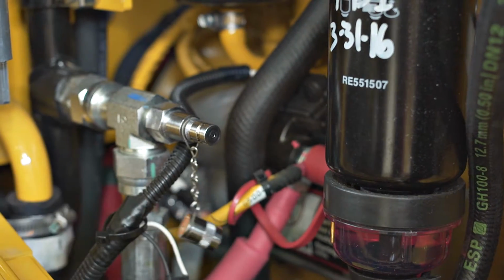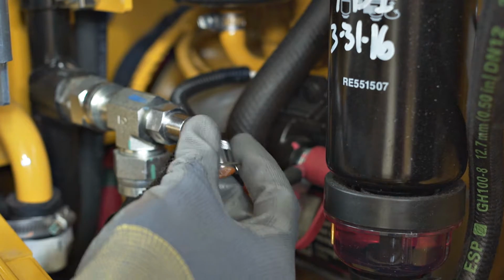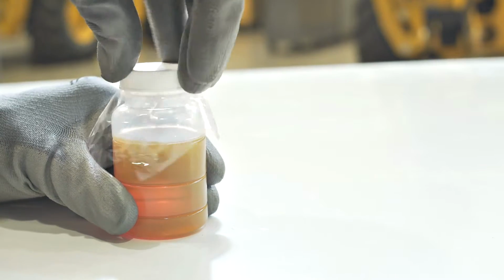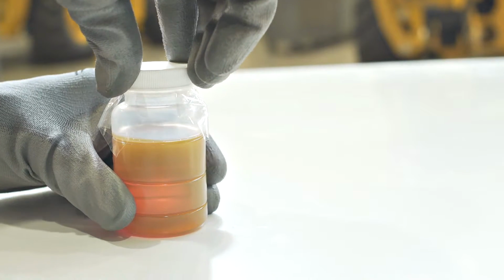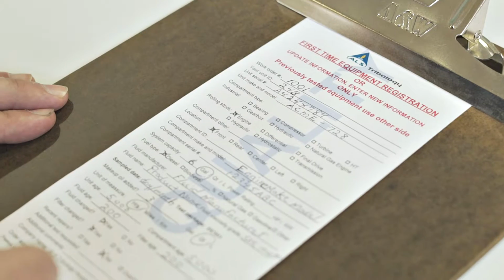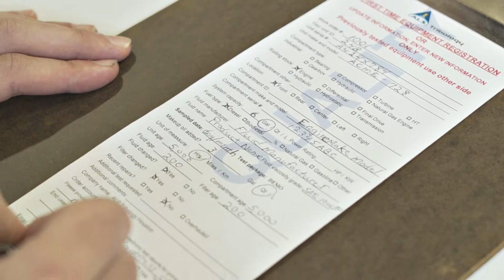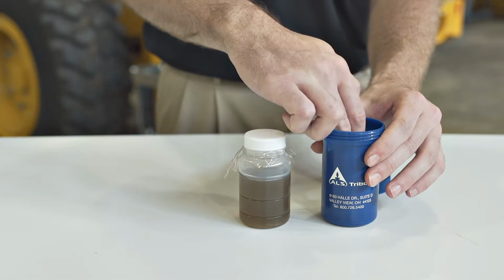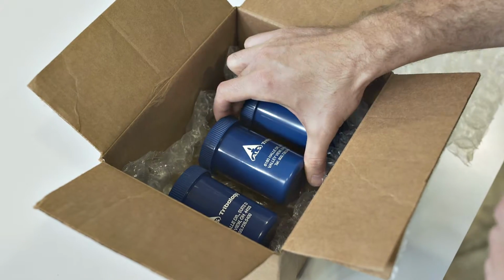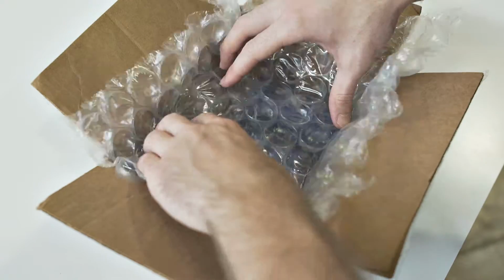Once a representative sample has been obtained, remove the probe tube from the sampling port and immediately seal the lid to the container. When properly performed, the oil sample will be warm, indicating that a representative sample has been obtained and all stagnant fluid was removed during the purge process. Fill out the sample information form completely and submit the form and sample to the designated regional lab for testing.